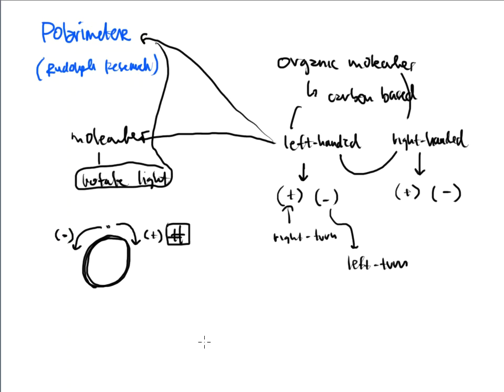All right, so if I kind of want to draw a schematic of the polarimeter down here at the bottom, what would happen is that I would typically have some type of long cylindrical tube, and this tube will have an inlet and an outlet on it. So that same syringe that I could use in the density meter, I can use in the polarimeter as well.